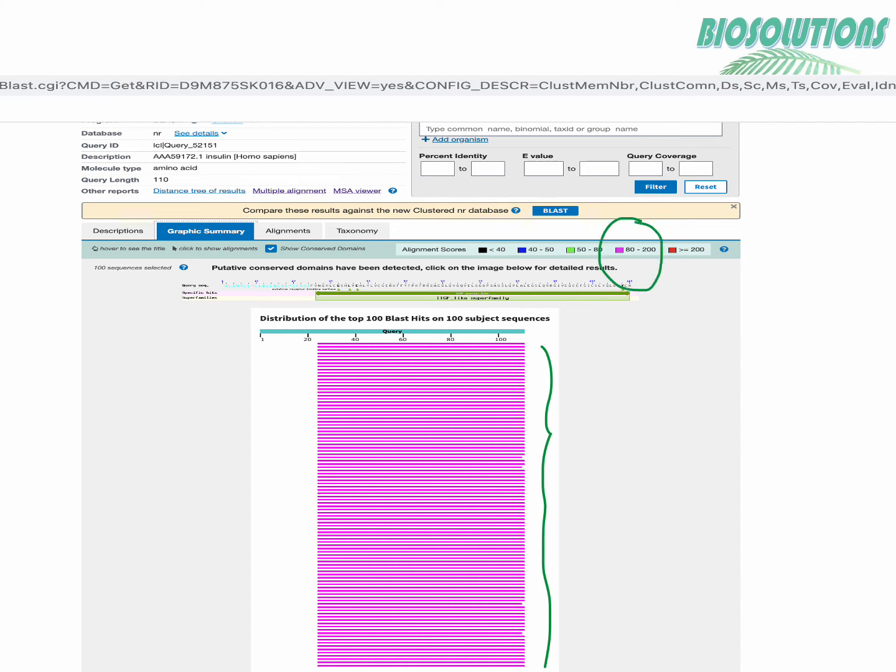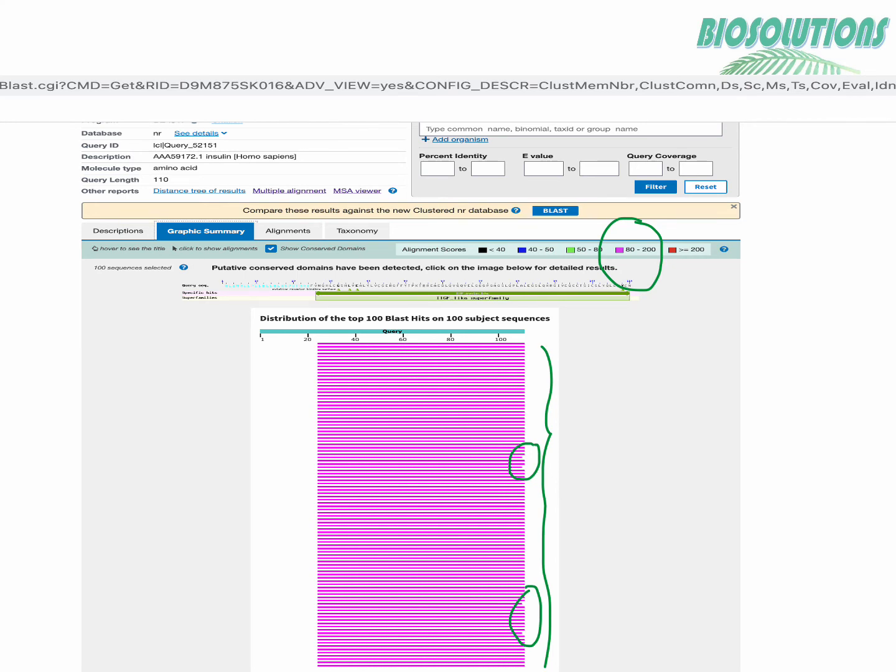Moving ahead, distribution of the top 100 BLAST hits on 100 subject sequences shows all graphics in pink color bars as the max scores were below 200 and between 80 to 200 range. The length of each bar represents the query cover whose values are given in description table.